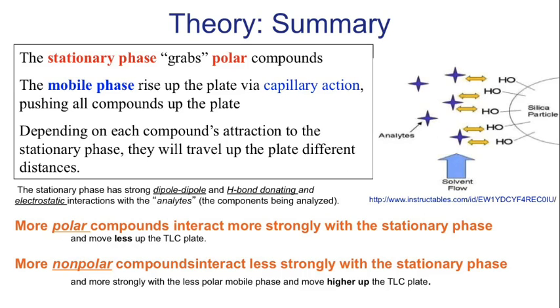So they move less up the TLC plate. If it's a nonpolar compound, it's going to interact less strongly with our stationary phase, which means it moves further up the plate. It's now part of the mobile phase, if you will.